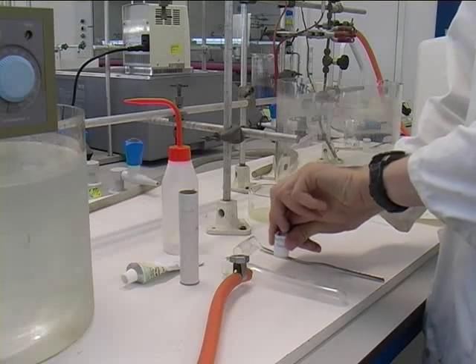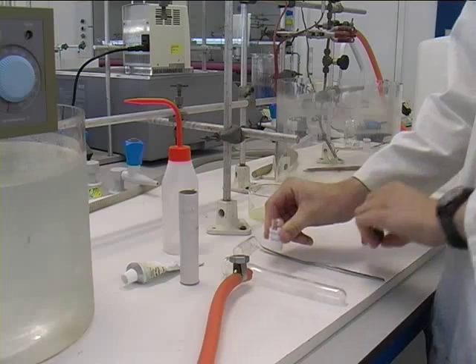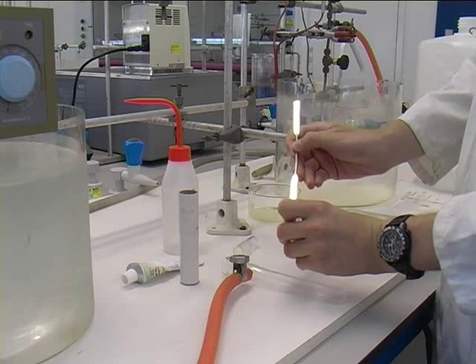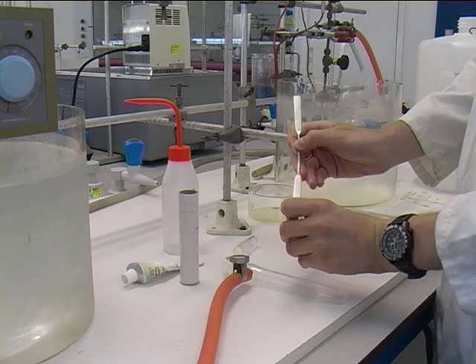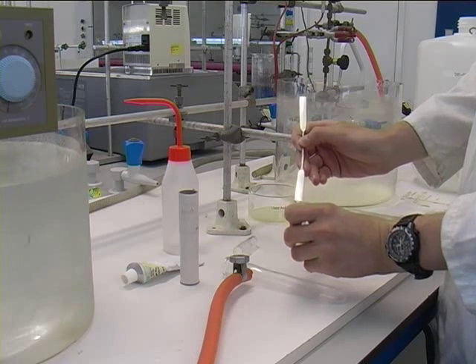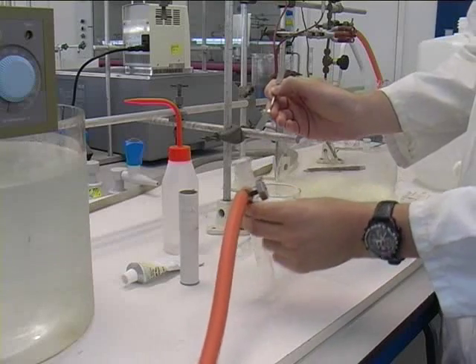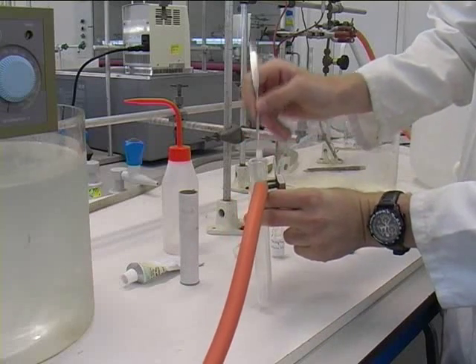The apparatus is set up by putting antibumping granules, ethanol, and a capillary into a boiling tube with a sidearm which is connected to the rest of the rig. The capillary is open at one end, and when placed in the boiling tube, the open end must be bottom most.